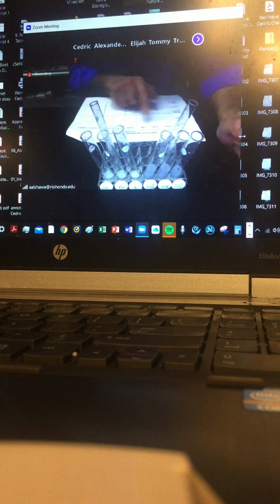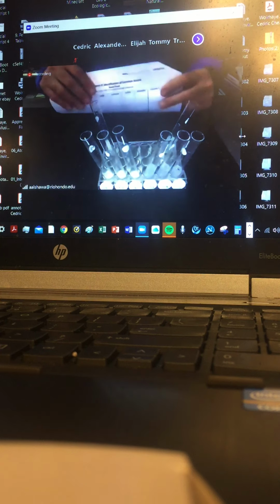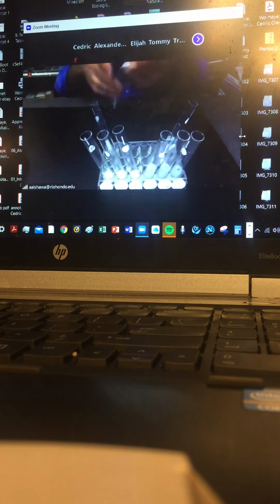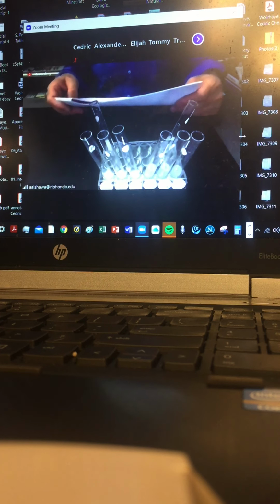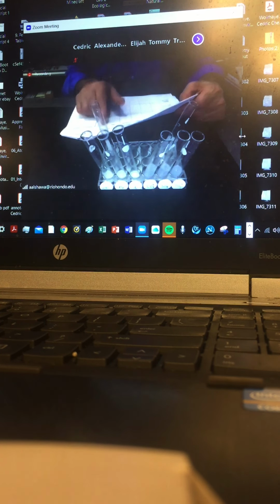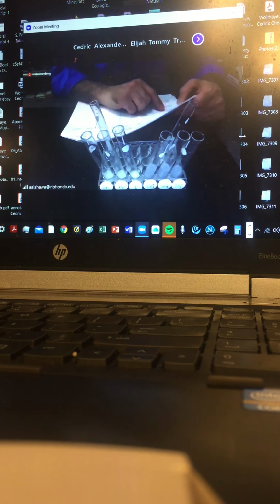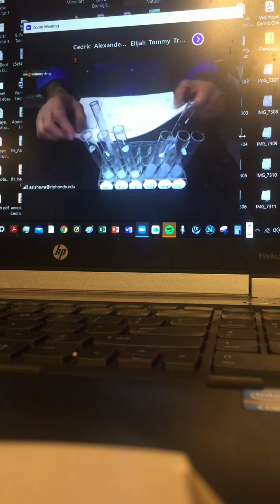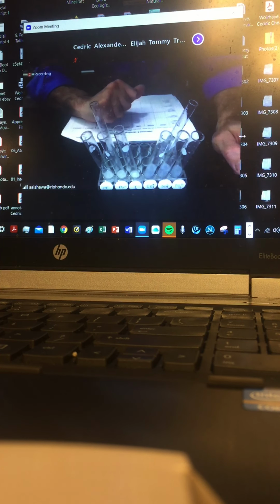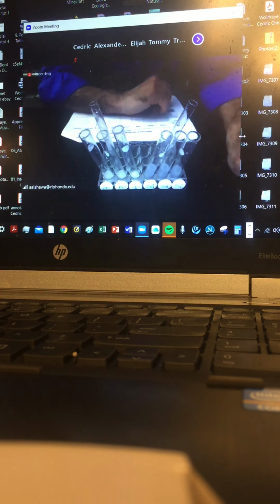So you've got 8 columns. Okay, so the last ones are for the unknowns. So write down the result with respect to the addition of nitric acid. So first, what happened when I added a few drops of the silver nitrate? Which one produced an outcome? What sort of color? And which ones retained their precipitate, with what sort of color? And which ones, whatever that precipitate, whatever that cloudiness is, is gone or faded out. Okay, so that will complete the first silver nitrate test.